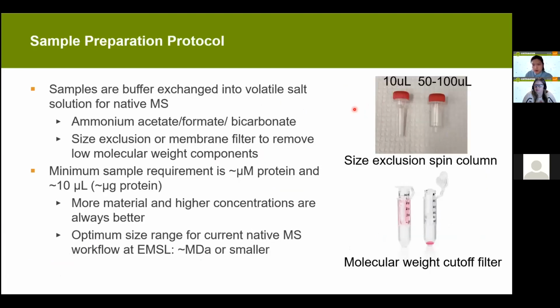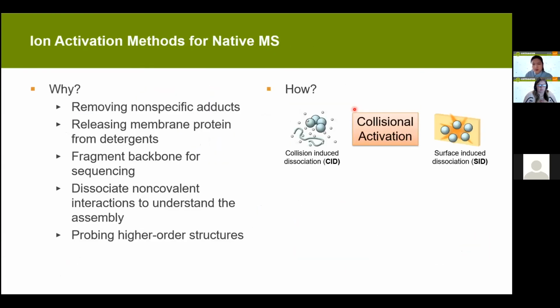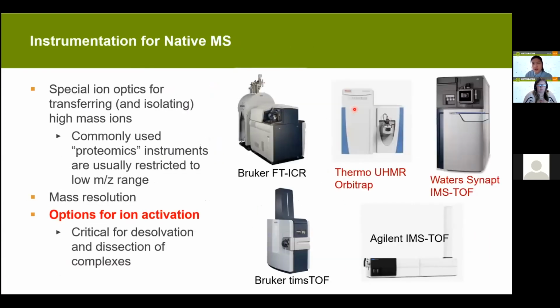Yeah, so for the transmission, if you remember from Joe's talk this morning, he did show quite a lot of details. I think the biggest thing is the in-source activation. Basically, you have different designs. You can trap them and then really heat them up by collisions, and that seems to be very effective, especially for membrane protein complexes.